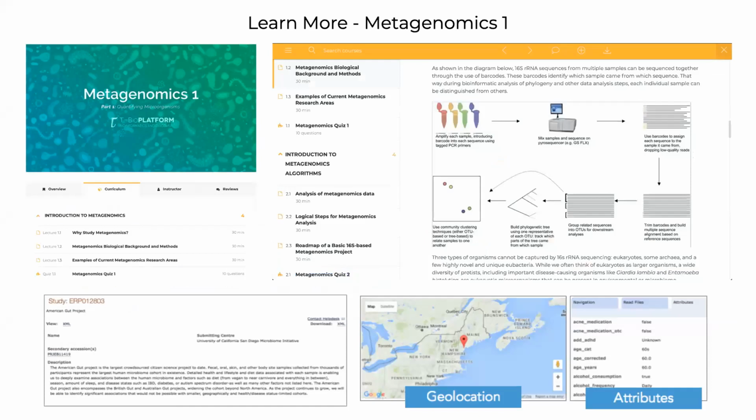One of the resources that we have made available to understand some of these techniques, like we mentioned, are applied both to viruses and to bacteria. It's a similar process, but to really understand some of these details, we have a number of resources that you'll be looking online, and I'll talk about this a little bit further, that you can complete to kind of get some more background information on this type of sequencing.